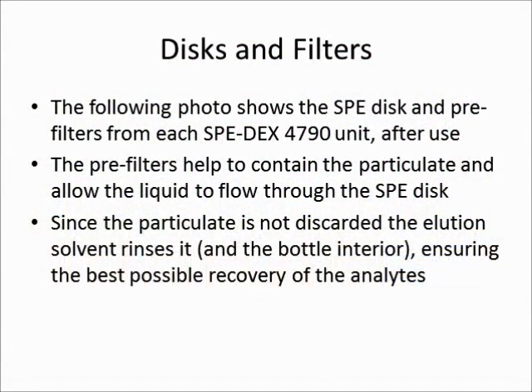Now that you've seen the samples flow through the solid phase extraction disk, we've taken them out, and you'll see what they look like. The pre-filters help to contain the particulate and allow the liquid to flow through the adsorbent disk. Since the particulate is not discarded, the elution solvent rinses it and the bottle interior, ensuring the best possible recovery of the analytes.